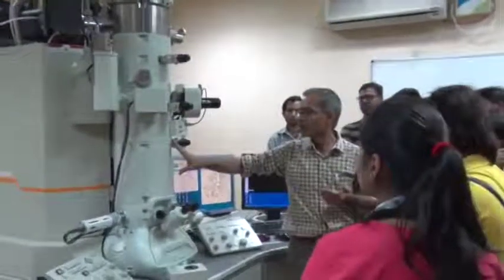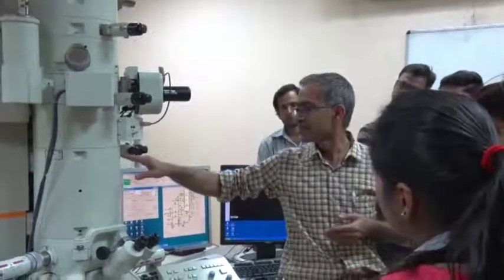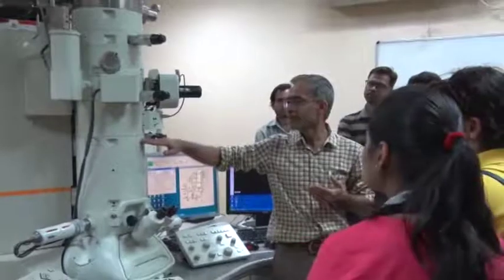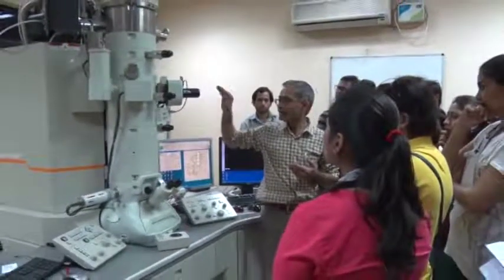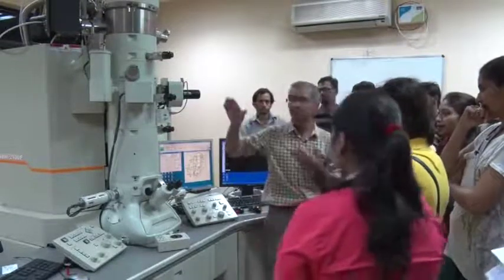So followed by that we have so-called intermediate lenses and projector lens systems, etc. And this is sitting inside the first intermediate image, selected area aperture. So this plane is conjugate to that of the sample plane, whereas this plane is one of the diffraction planes. So we have two sets of planes.